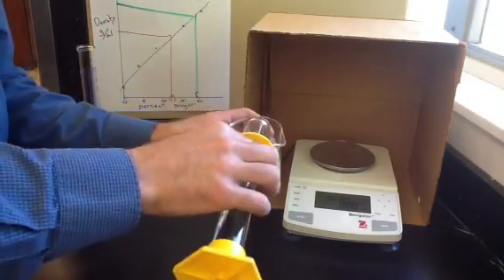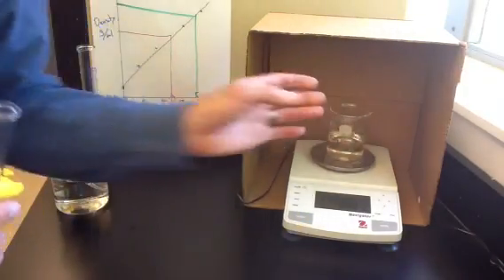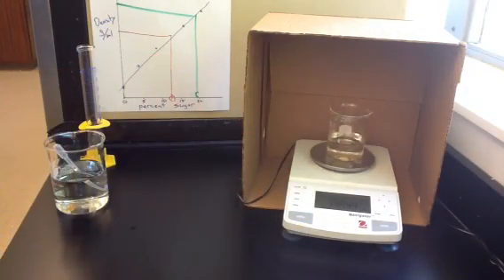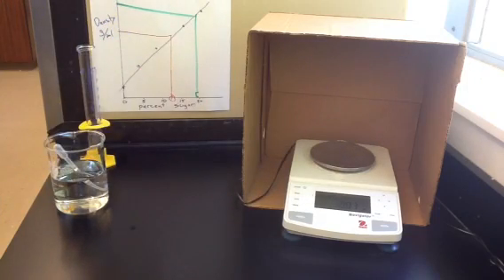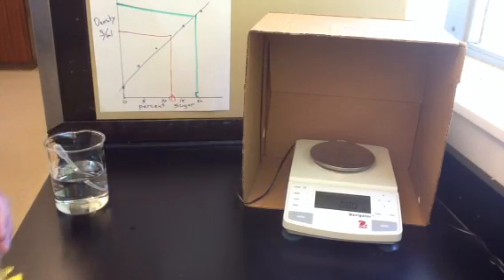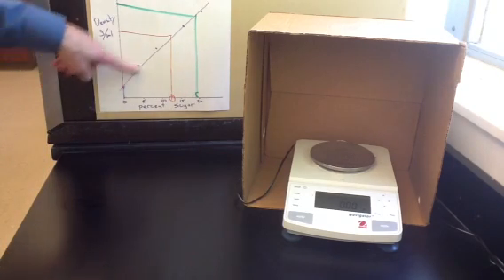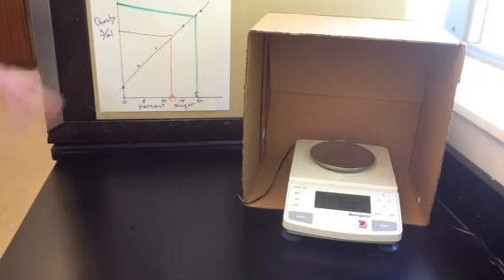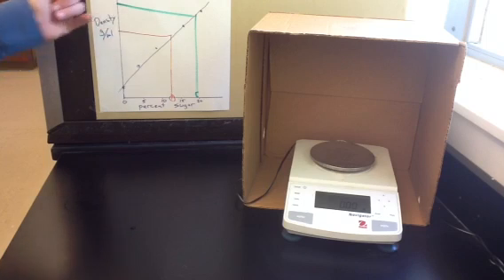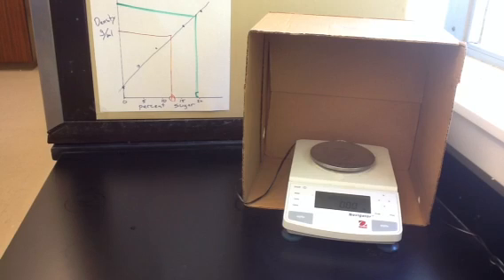20%, this is our most concentrated solution, so we would expect this one to have the highest mass and the highest density. And the mass of 100 milliliters of the 20% solution is 199.48 grams. So with this information, you'll be able to calculate the density of each one of these solutions. And then with the density of these solutions, you'll create a graph that shows how density increases as sugar content increases. Now we're going to measure the density of some soft drinks, and we can use those densities to find the sugar content of those drinks.